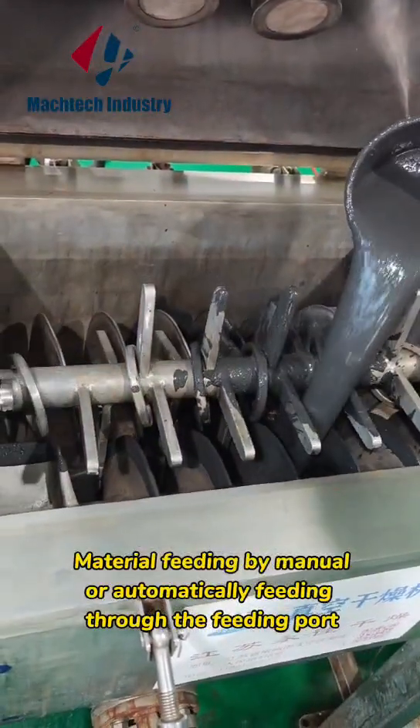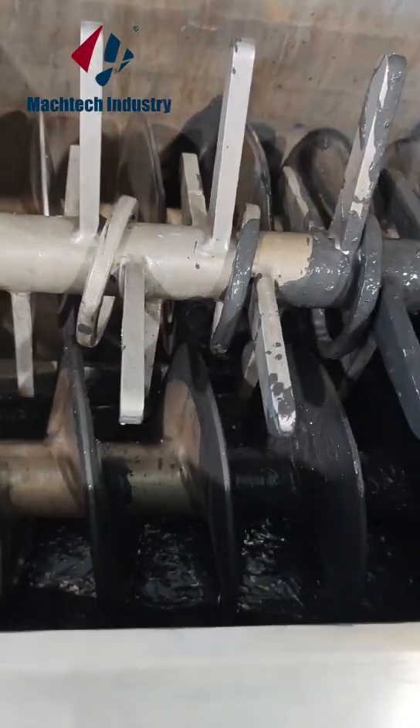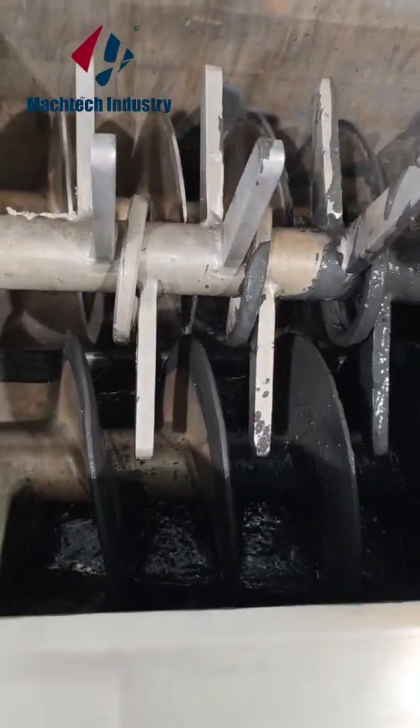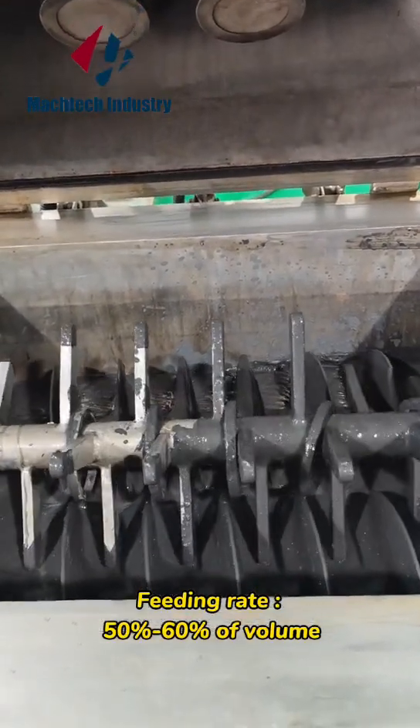Material feeding by manual, or automatically feeding through the feeding port. Feeding rate: 50% to 60% of volume.